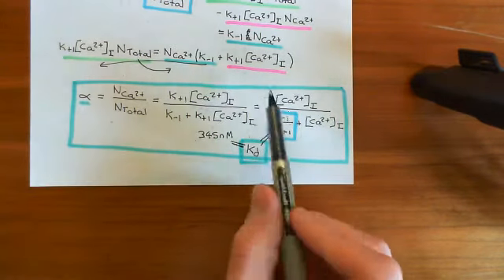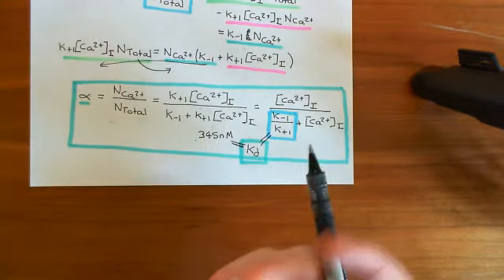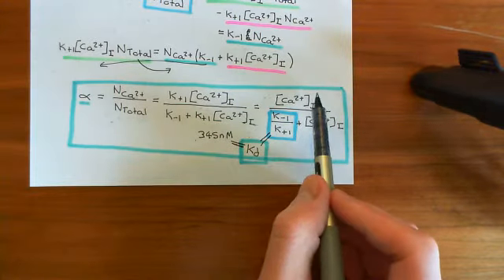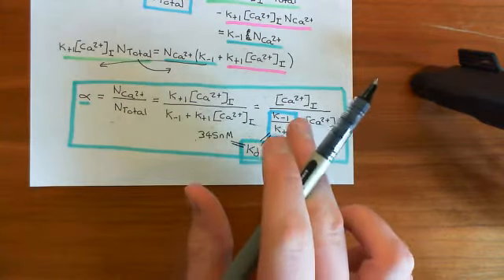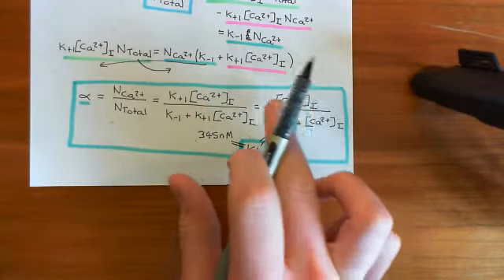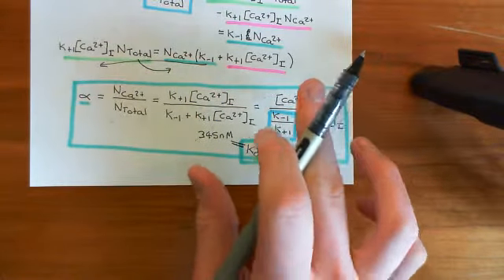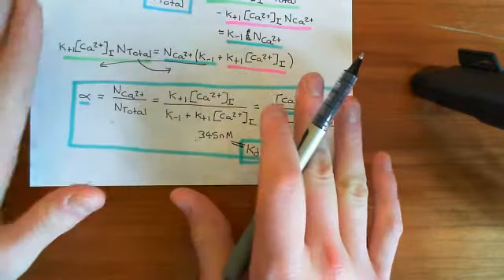If the number of Fluo-4 molecules that you loaded into the cells actually got close to the number of calcium ions within the cell, then this model would break. Remember, that was the assumption that we made in order to use this model. If the number of Fluo-4 molecules gets anywhere close to the number of calcium ions within the cells, then this no longer works.